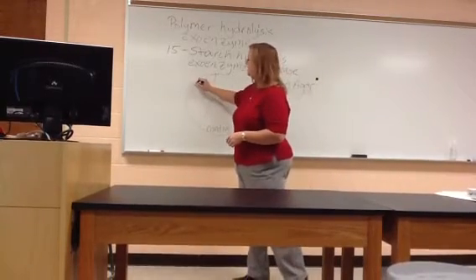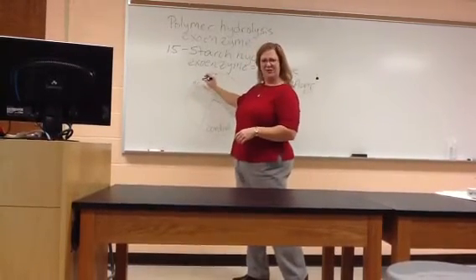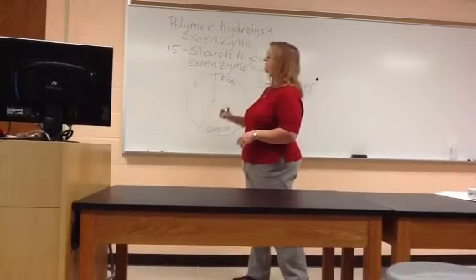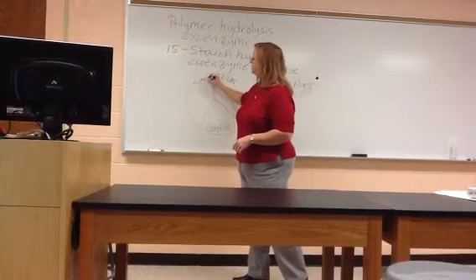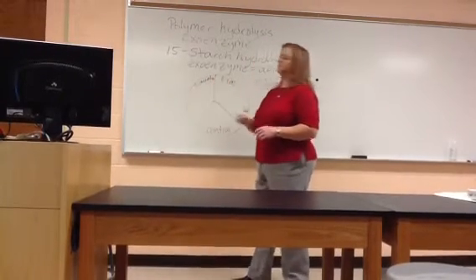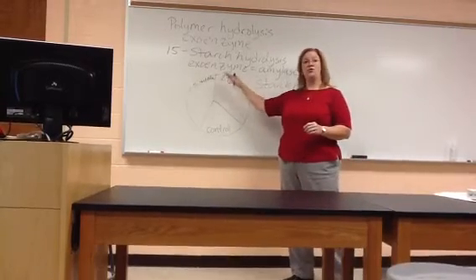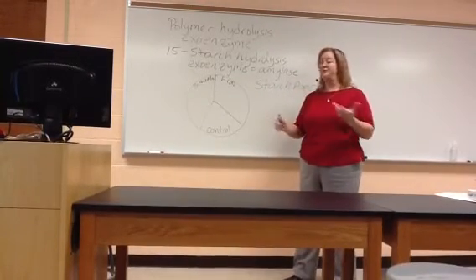So you've got, I think, B. subtilis, is that the one? E. coli on that side. Yeah, well, it doesn't matter. E. coli, what's the other one? B. subtilis, okay. So you label which bacteria you're putting in which section. And again, remember, try and write small off toward the edge. You don't want to block your view.